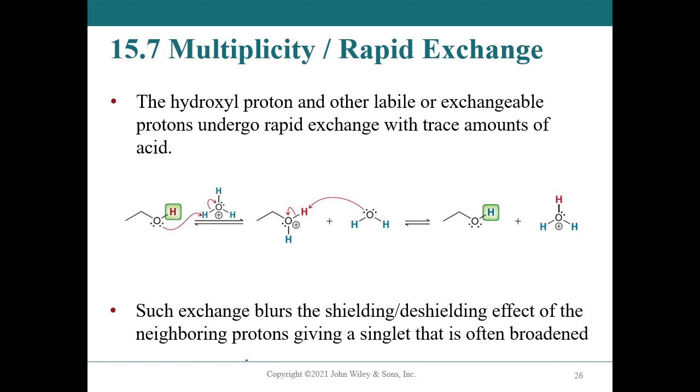And because of that exchange, that's happening rapidly enough that any effect that the spin up, spin down might have is being negated, because you might have one on for a fraction of a second, it comes off, a different one comes on, and it gets averaged out. And so those don't show splitting. If you have scrupulously dry sample and solvent, you can actually see the splitting for that.